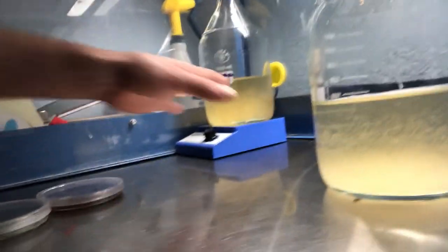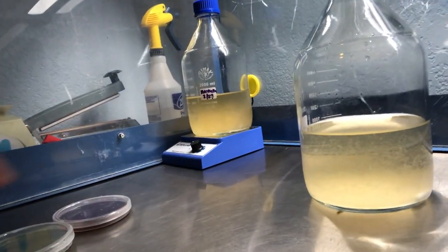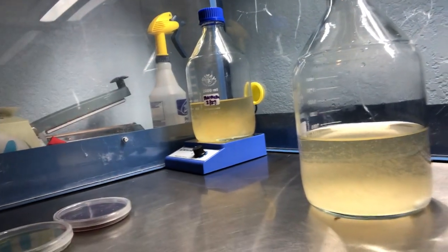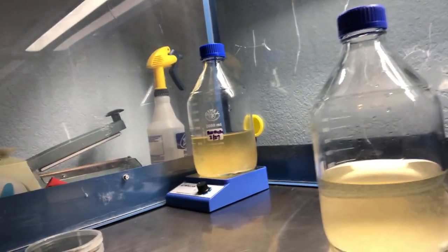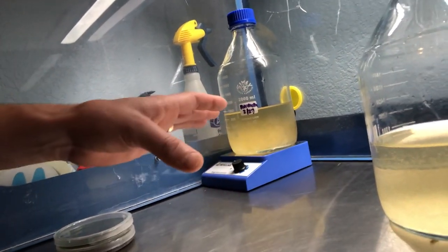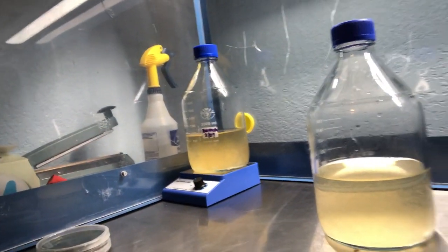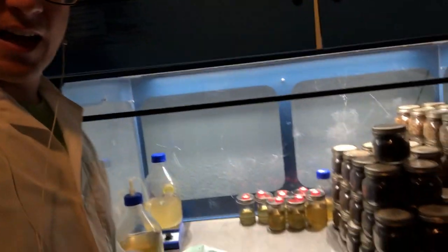So I'm still gonna move forward with my morel liquid culture because that's going outside anyway and it's gonna be exposed to lots of bacteria and hopefully beneficial bacteria. So I'll go ahead and make some sawdust spawn and some grain spawn, and then I'll show you the media extractor.